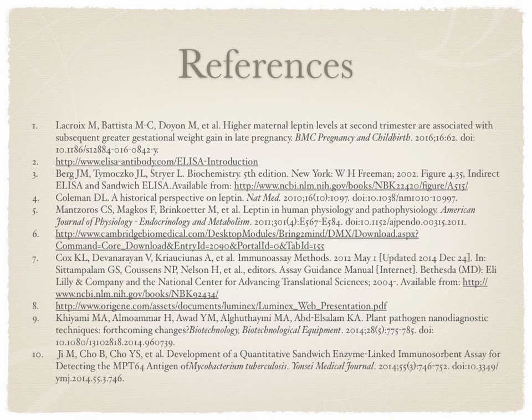In conclusion, ELISA is very common among the scientific community. Using this technique can detect antigens and antibodies. This is especially important for the medical community and also the environment and many other growing fields of study. The 96-well plate allows a vast amount of samples to be tested at a given time. The Luminex technology is also very accurate. Just as this technique was used this year to discover the concentrations of leptin in pregnant women, I'm sure that it will continue to be used over time.